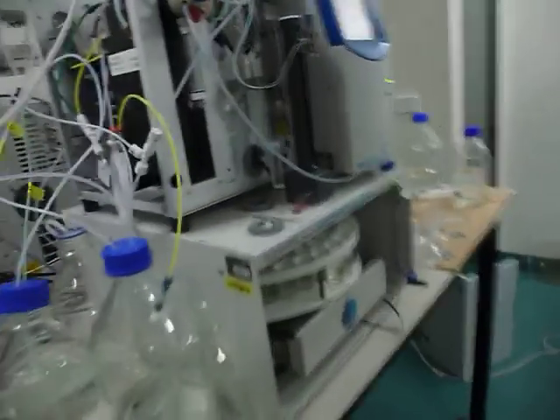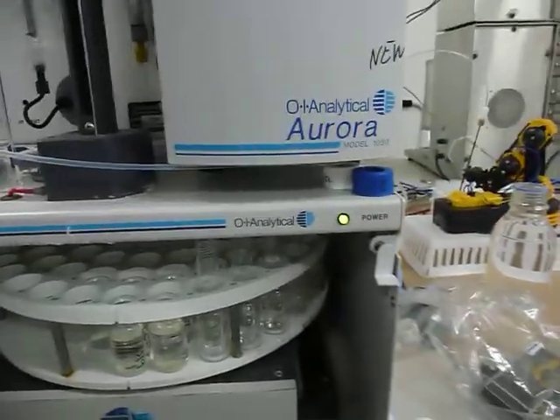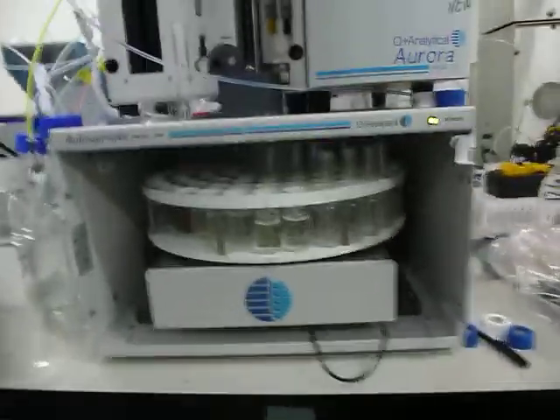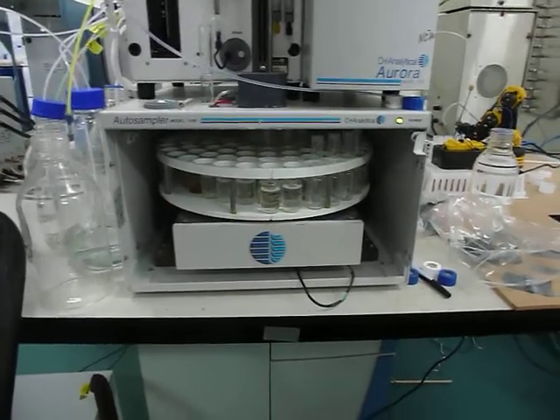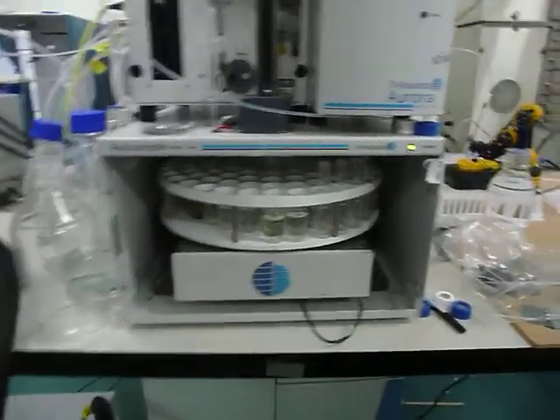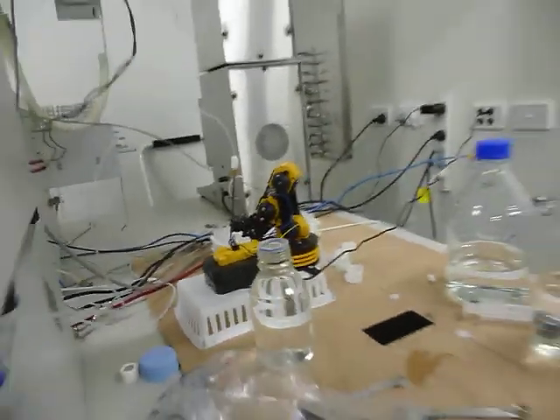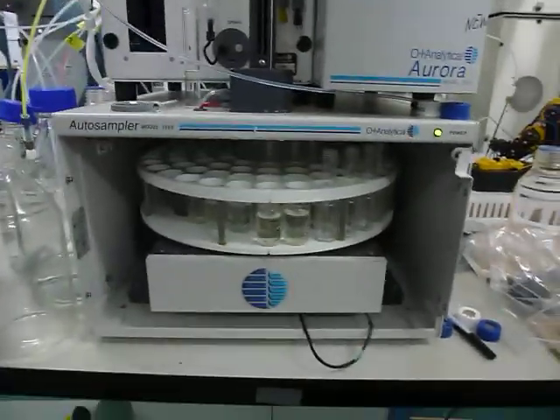This TOC analyzer here is the Aurora TOC analyzer. It's made by OI Analytical, a US company. It comes with this autosampler. This autosampler here costs about $20,000 Australian dollars. That was the price that people paid here, while the robot here costs $90. And so far it seems that I can use the robot instead of this.